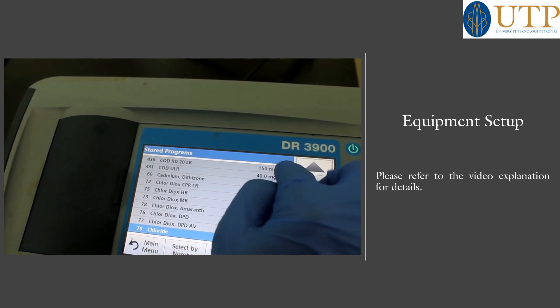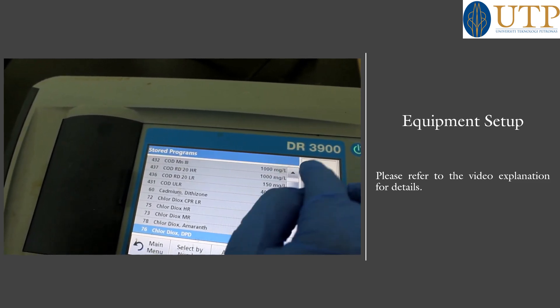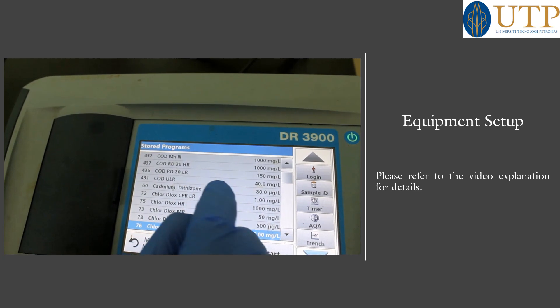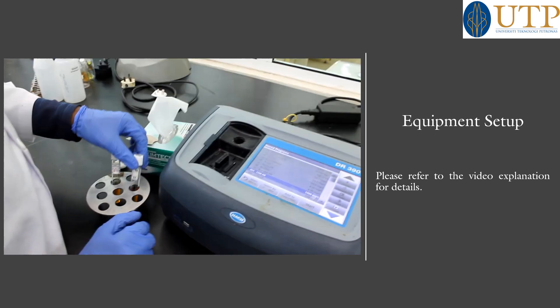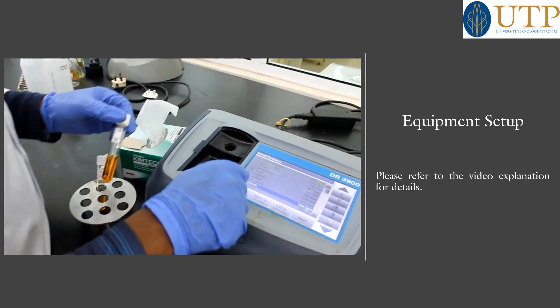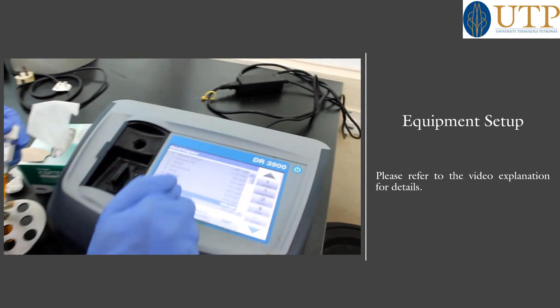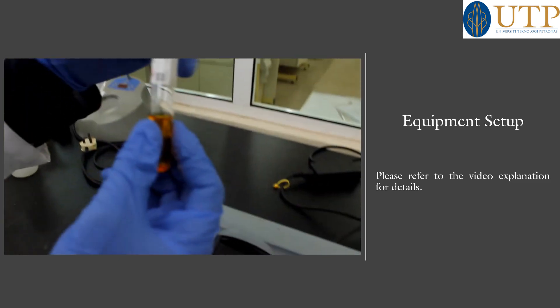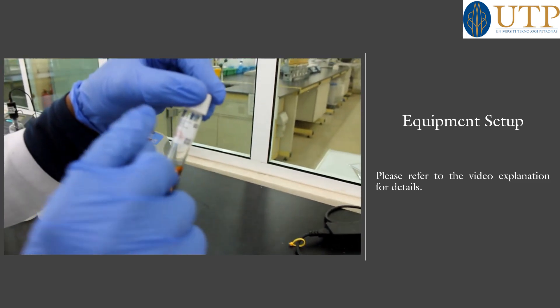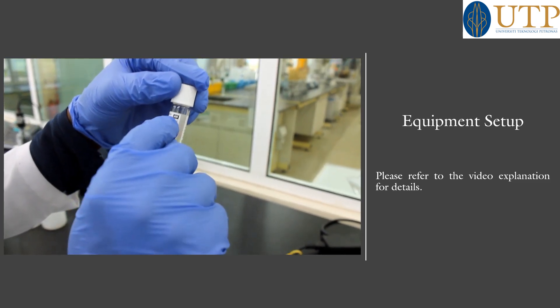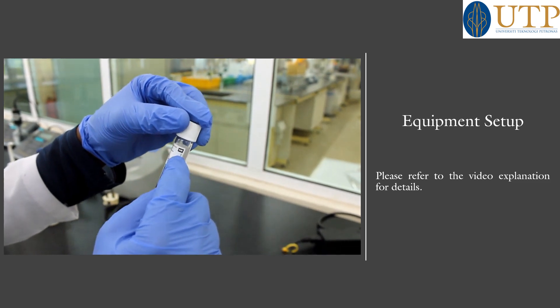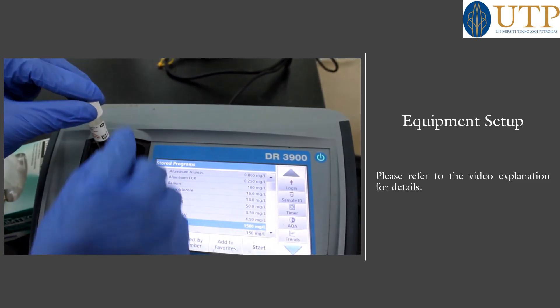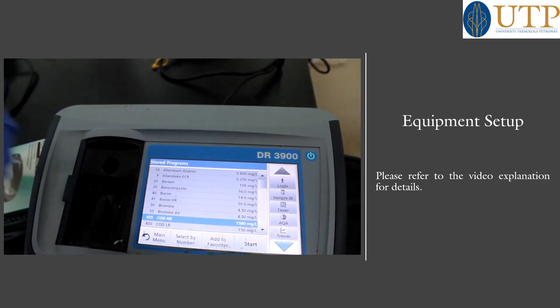Here is COD. We have COD HR and COD. You can see we are set already at COD High Range, because the COD vial I have here is COD HR — High Range. Click.